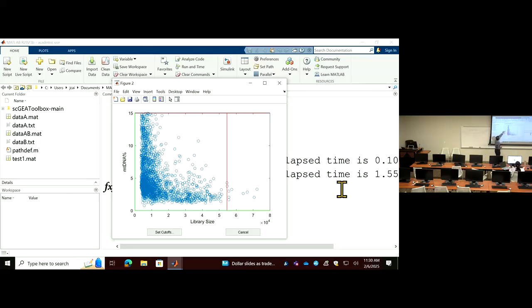If you want to set this cutoff lower, you can drag this bar down to 11%, 10% if you're really stringent, if you want to get rid of the impact of mitochondrial DNA genes in individual cells. This dataset has already been trimmed, so you see all the cells have lower than 15%. But in your original data, if you download it directly, some cells may have 80% or really high numbers, so you really want to set a cutoff there.